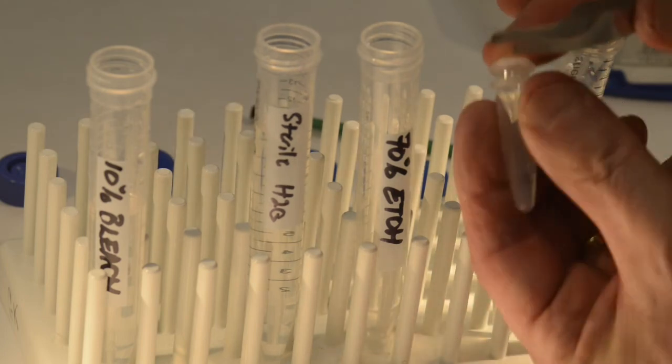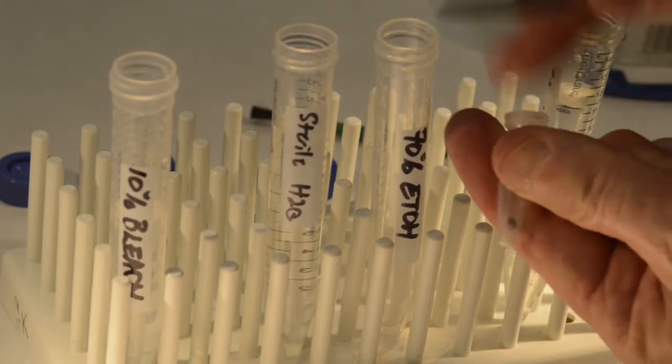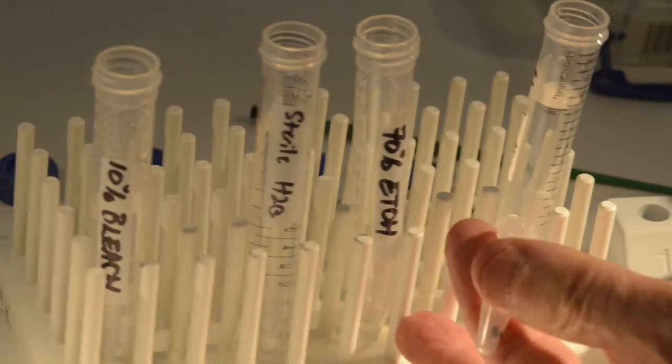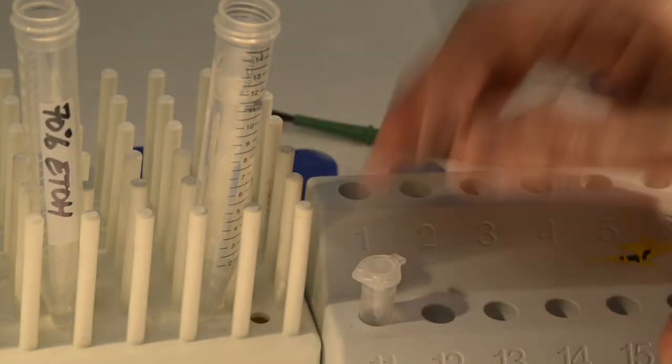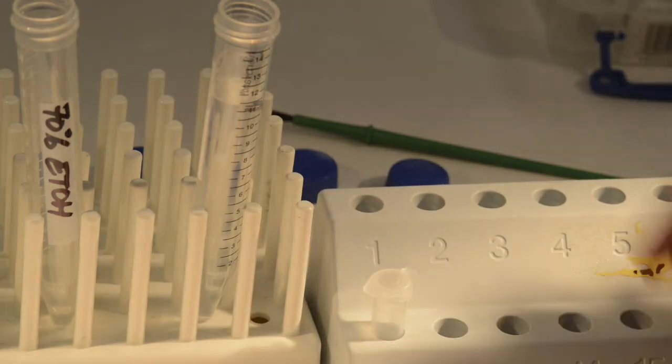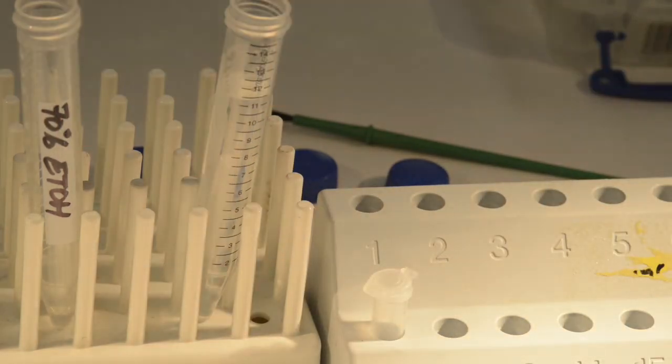And now you're ready to either extract the microbiome from that beetle for culturing, or extract DNA for next-gen sequencing of the microbiome 16S rRNA gene. This ends the video on surface sterilization.